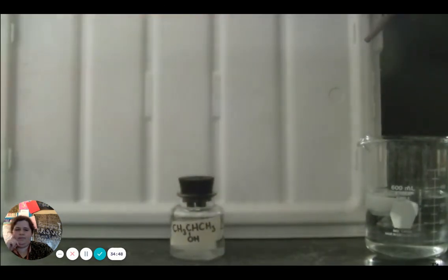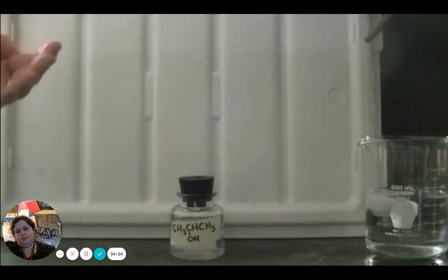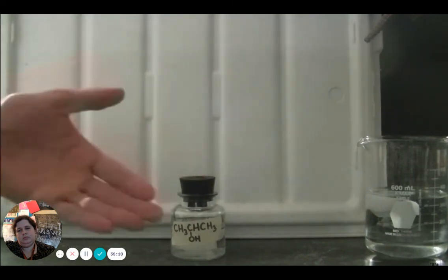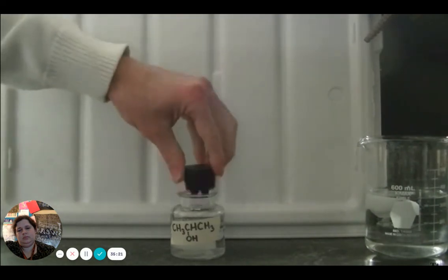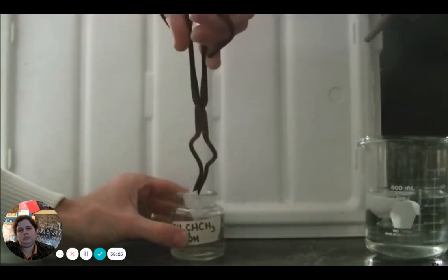Now isopropanol. And one might hypothesize that because the methanol, a one-carbon alcohol, completely combusted, and the two-carbon alcohol, ethanol, showed some signs of both complete combustion and incomplete combustion, one might surmise that the isopropanol, which is 3 carbons long, will follow this trend, and we should see a lot more incomplete combustion rather than complete combustion with the isopropanol. Let's run the combustion reaction and find out.